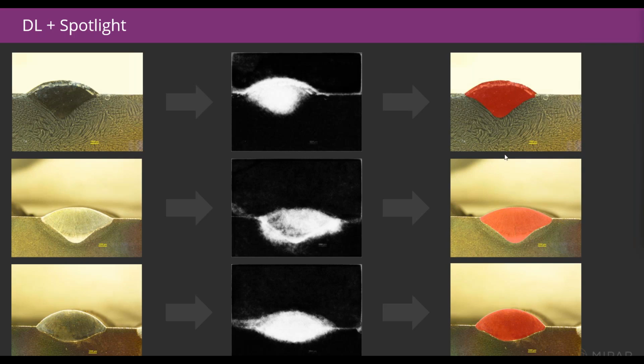So again, we don't necessarily know precisely what features it has learned that define these boundaries. I'm guessing in this case, it's recognizing this transition between a uniform dark area and a more textured area. In this case, it's probably picking up more on the intensity differences. And in this case, there's something there. There are a few different things going on, but there is certainly something telling you there's a boundary. In Spotlight's case, it's using its learned characteristics of general object detection in order to find those boundaries.